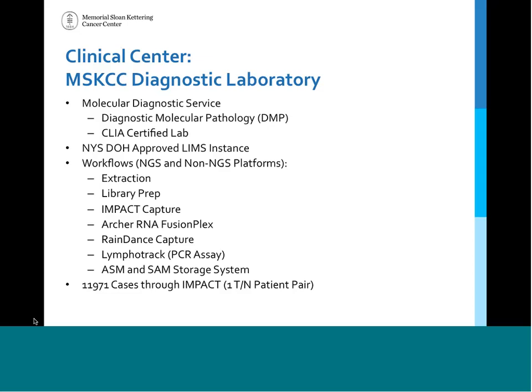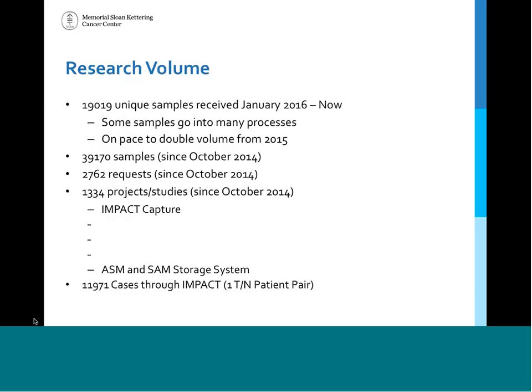They also have several workflows that interact directly with their three-dimensional storage system, the ASM, which is used for DNA storage, and the SAM, which is used for RNA storage. To date, they have processed 11,000 patient pairs through their Impact, which is our clinical version of a capture panel used in the lab.